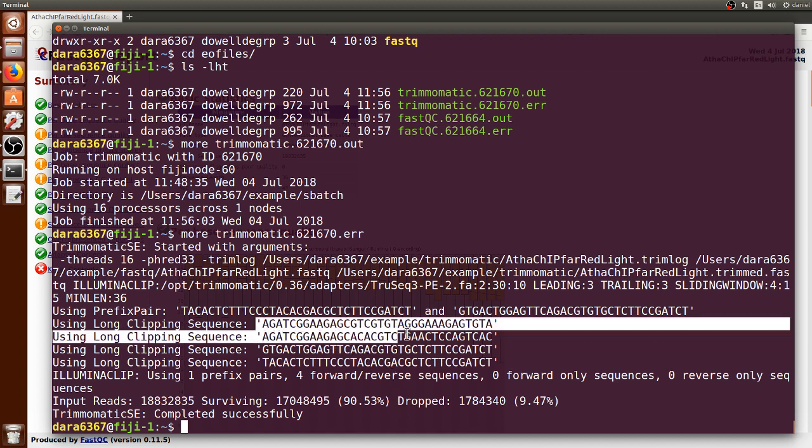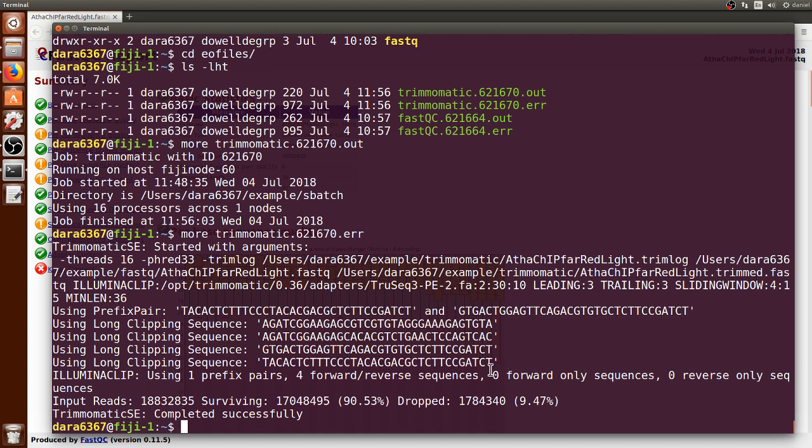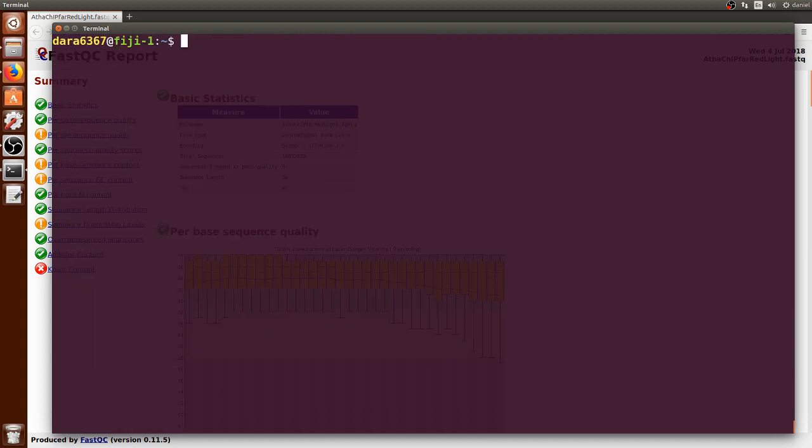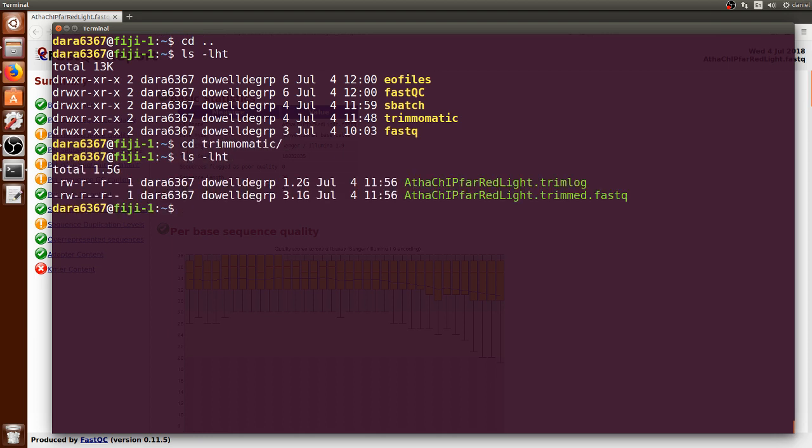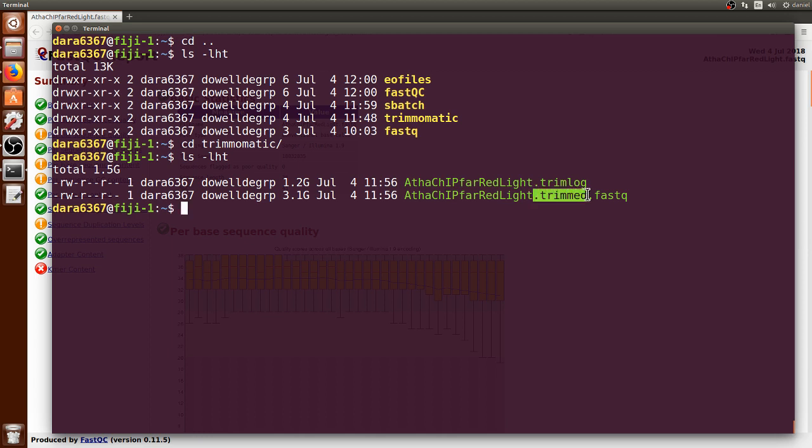So that's good, that's essentially what we wanted Trimmomatic to do, to remove bad sequences. We can now clear the screen first. If we go up one directory and we list it, and we can go to the new Trimmomatic folder and see that it contains two new files. This is a new FASTQ file that has now been trimmed and is now ready to be used for subsequent analysis or mapping to the Arabidopsis thaliana genome.